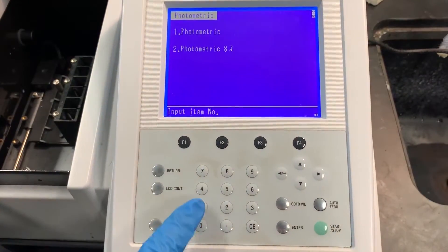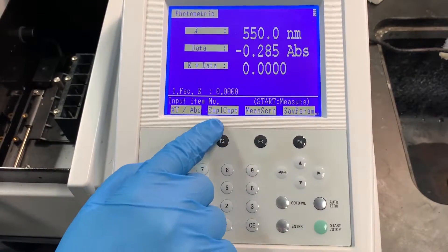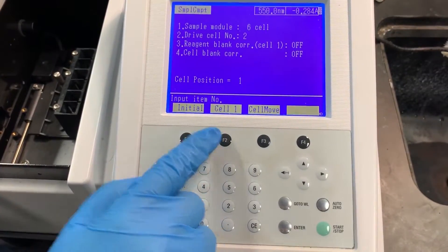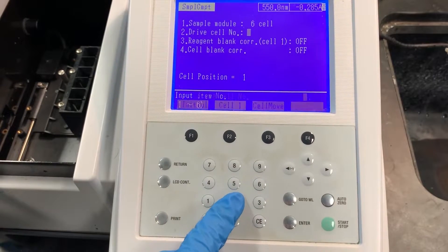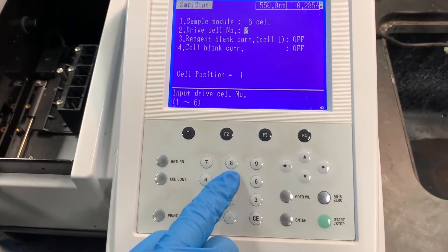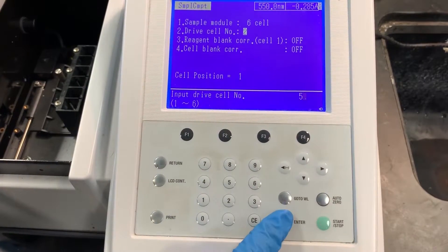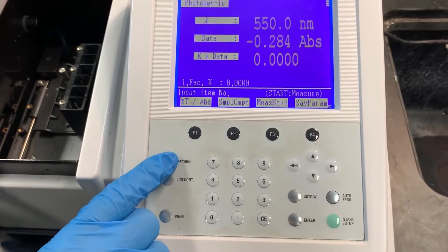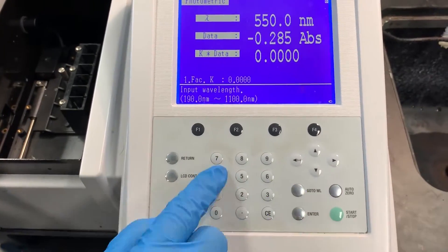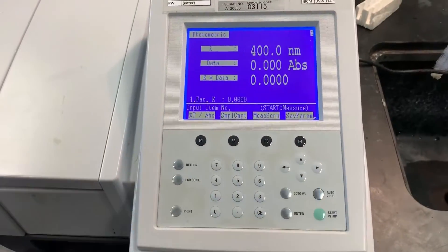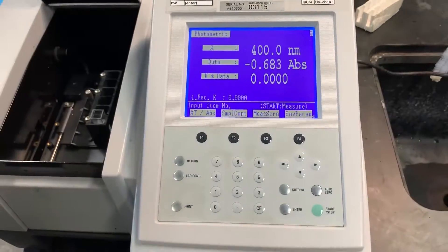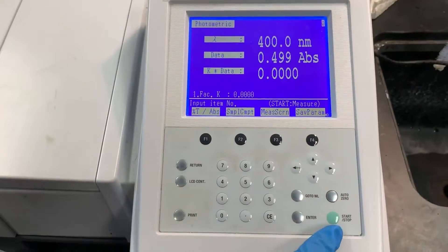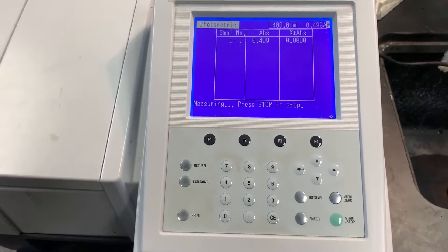To analyze the absorbance of multiple unknown samples, select photometric, photometric again, and sample compartment. Adjust the drive cell number to the number of unknown samples you intend to analyze, and return to the previous screen. Calibrate the machine with a blank cuvette as previously done. Insert the multiple unknown samples and press start to obtain the absorbance values.